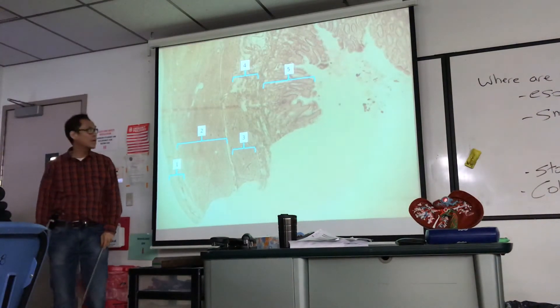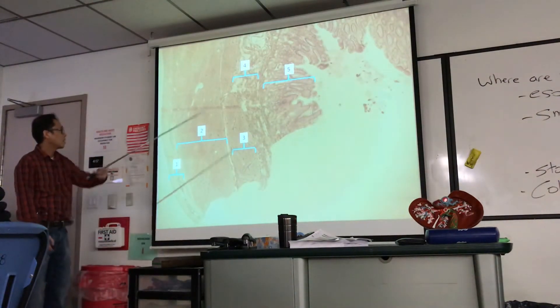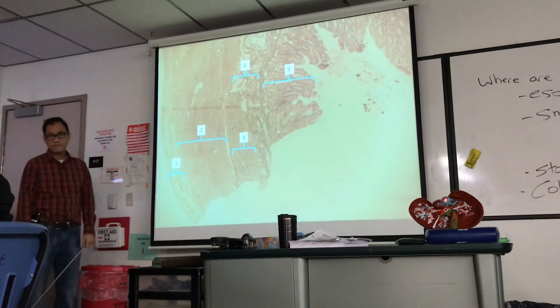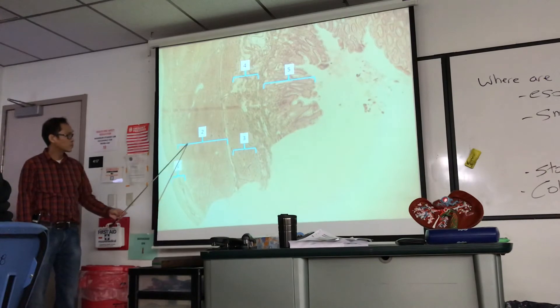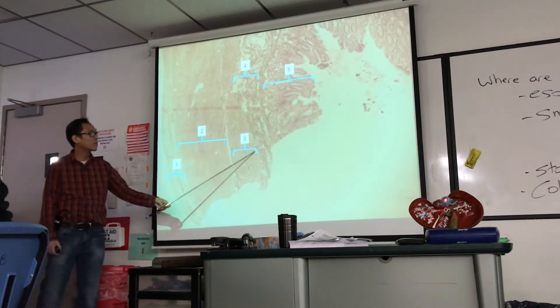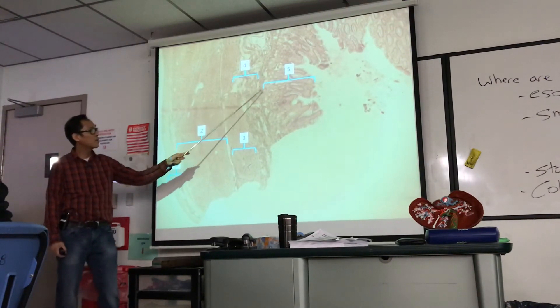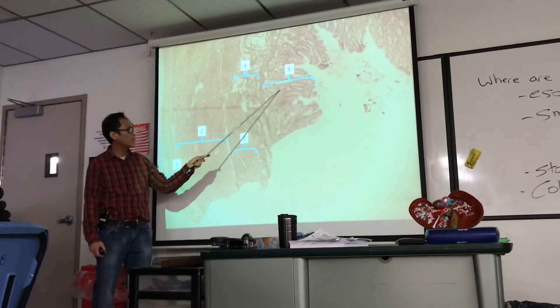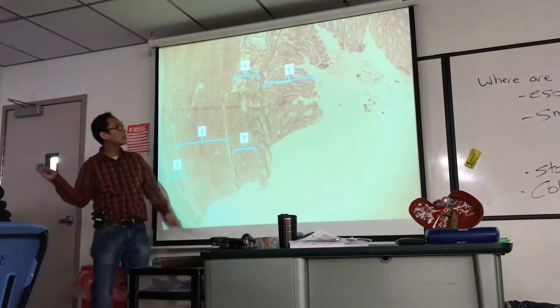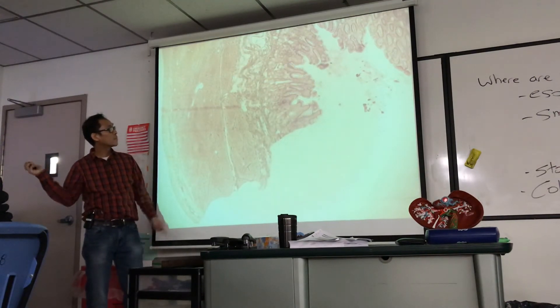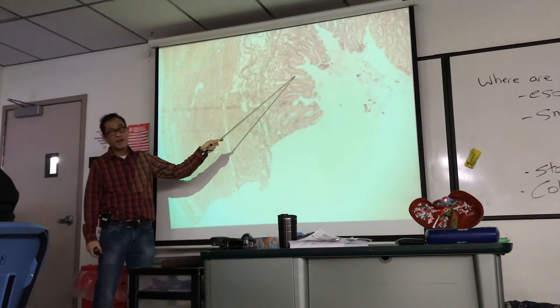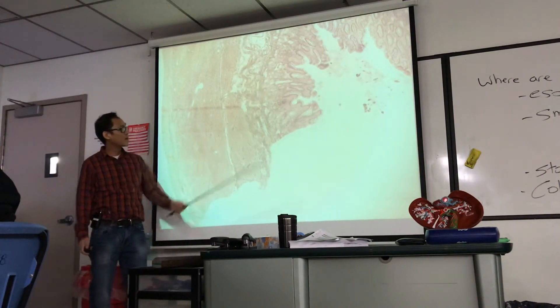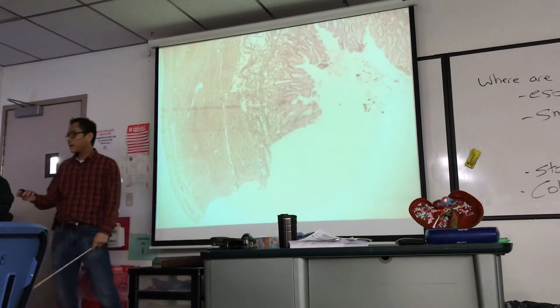Still stomach — I have it bracketed here. These three layers are the three layers of muscularis externa: longitudinal, circular, oblique. Submucosa, mucosa. I could point to that gastric pit, and point in there — gastric gland. Just pay attention to where it points to and I don't think you'll miss it.